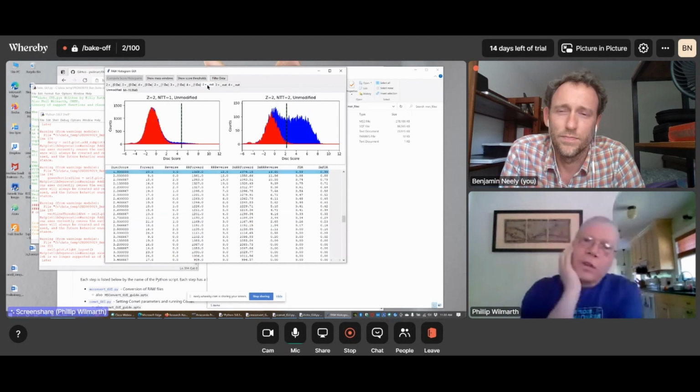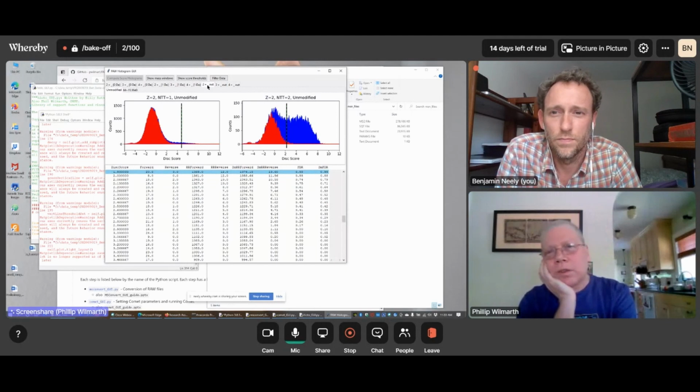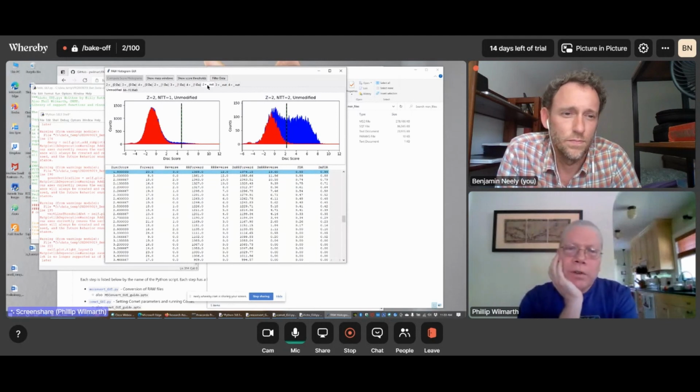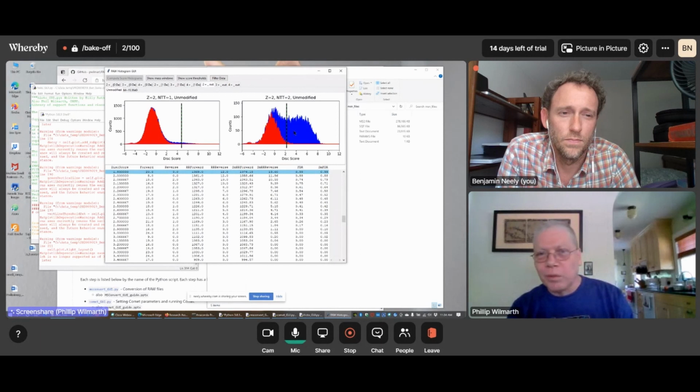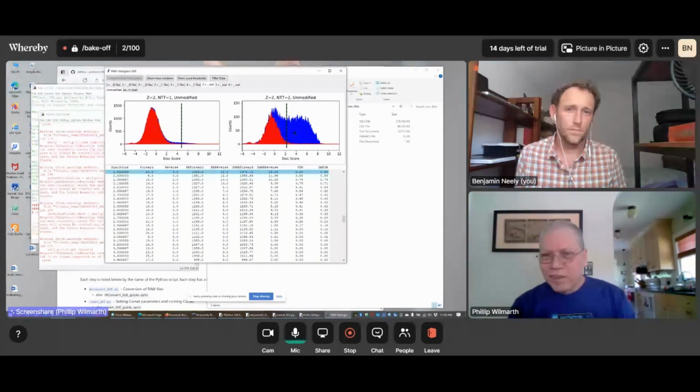Now, another thing that's rather interesting, a lot of people don't realize there's a lot of peptides that are sequenced and identified that don't have an accurate mass at all. So here we actually have quite a few 2+ peptides that were not inside the 0 Dalton window or inside the 1 Dalton window. And when you look at that wide tolerance delta mass histogram, you don't see any other regions where there seems to be any excess blue matches across there.